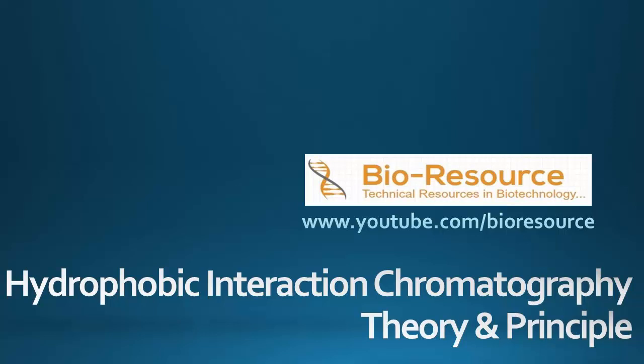Today we are going to discuss hydrophobic interaction chromatography, the theory and principles of hydrophobic interaction chromatography.